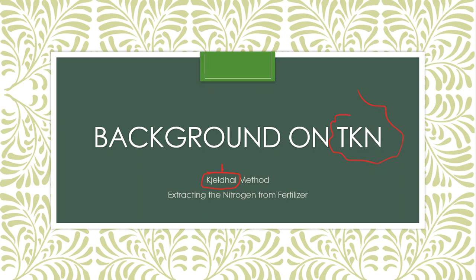And the reason that I'm saying that is because the Kjeldahl method is still used, especially in an environmental or food and beverage company, almost on a daily basis. Kjeldahl is very important, but yet it is something that many people or many classes or many instructors do not introduce. And the Kjeldahl method is all about the N of TKN. If we know the K is Kjeldahl, the N is actually going to stand for nitrogen.